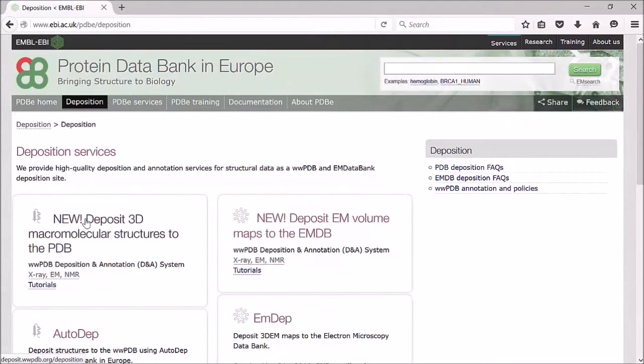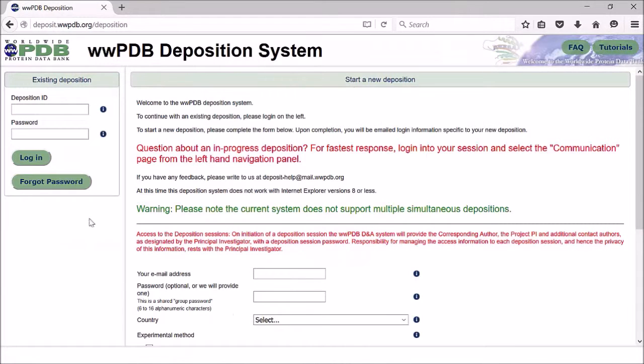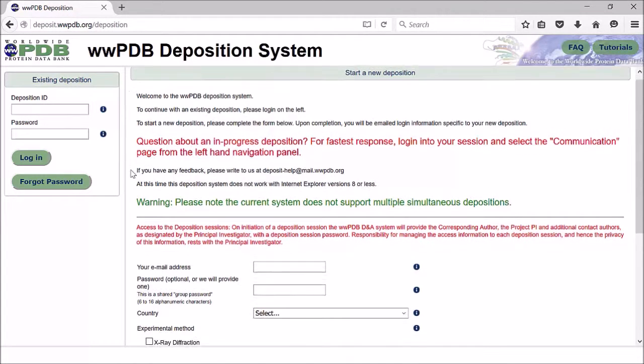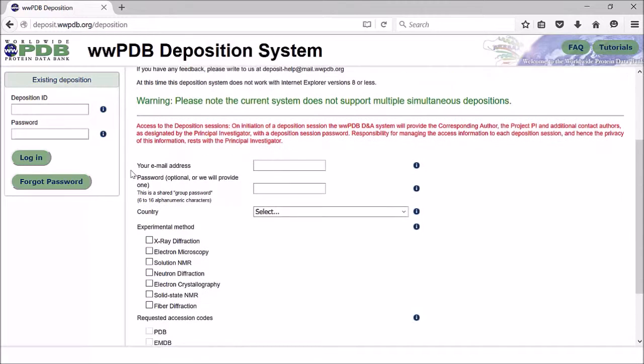If you click on one of these links at the top, it will take you to our deposition system. You'll see at the top left that it's the Worldwide PDB, because this is in collaboration with our colleagues at RCSB and PDBJ, as well as BMRB who deal with NMR data.